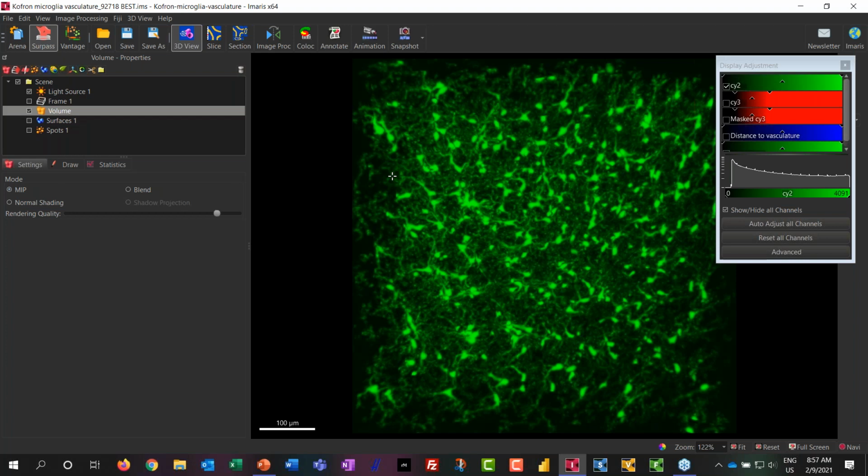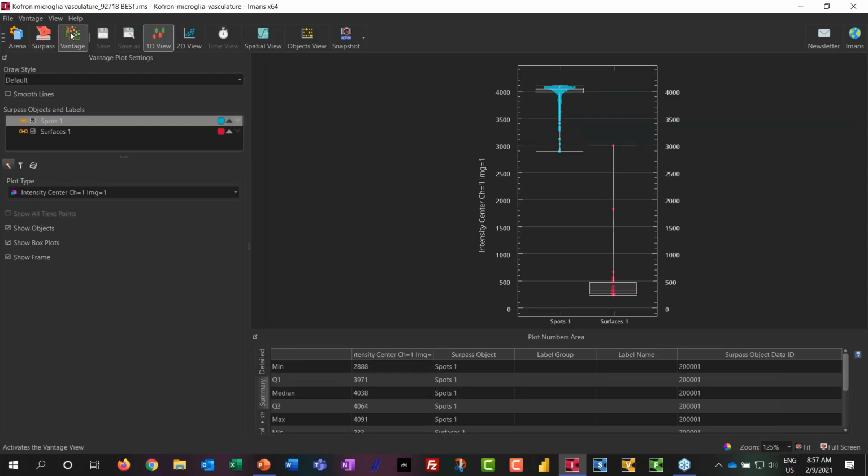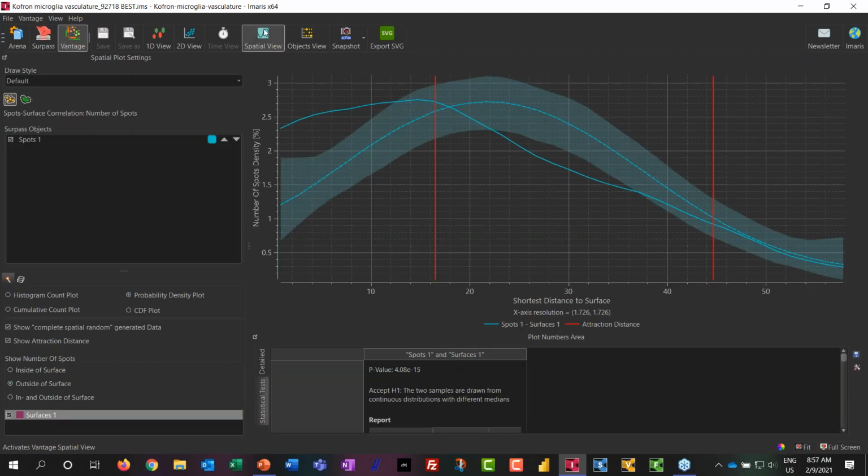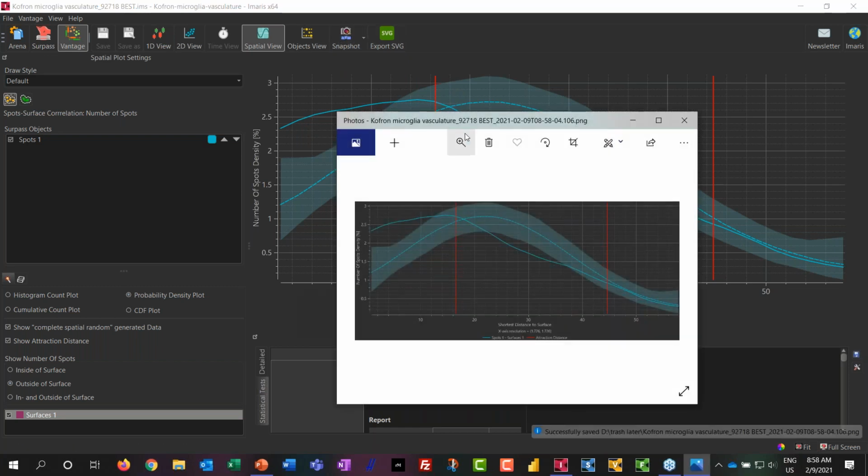Right. So you also had some questions about the export of the plots. Thank you for these wonderful questions about this. We do have the ability to take snapshots of these plots. I'll take a snapshot and we'll get that out.